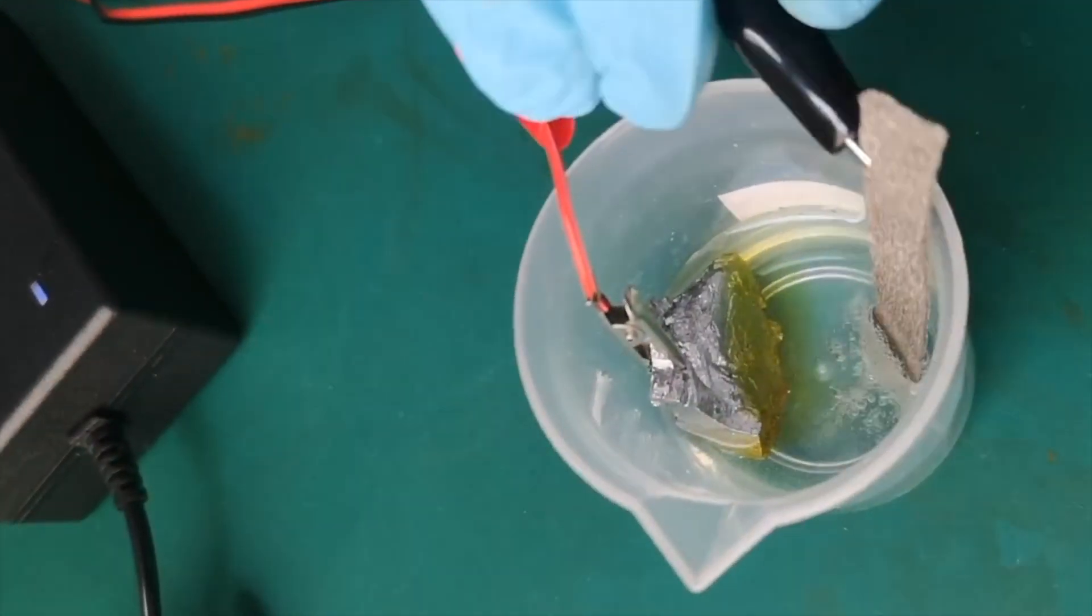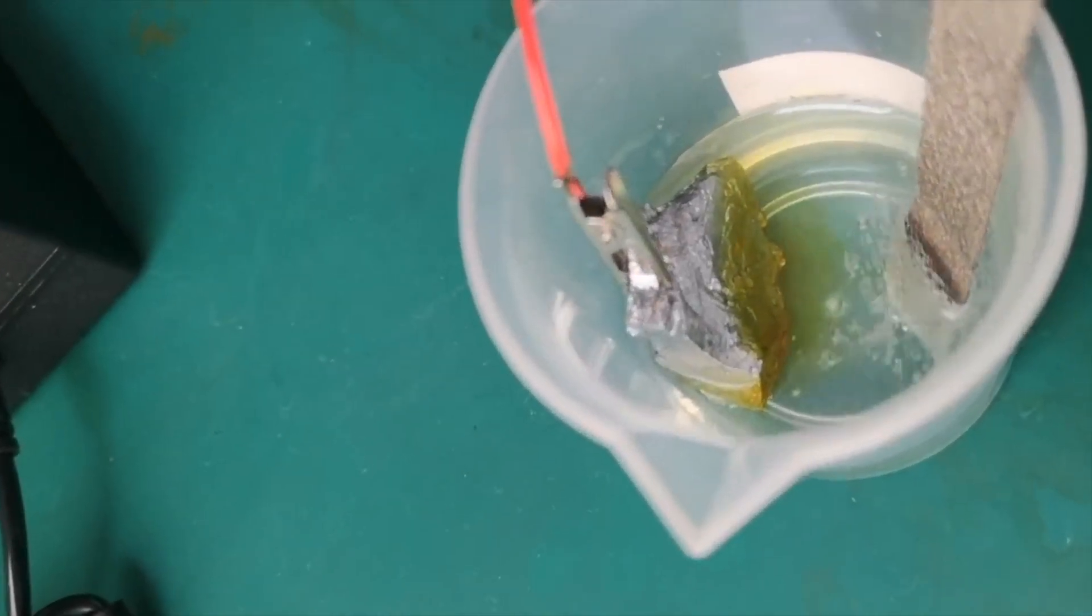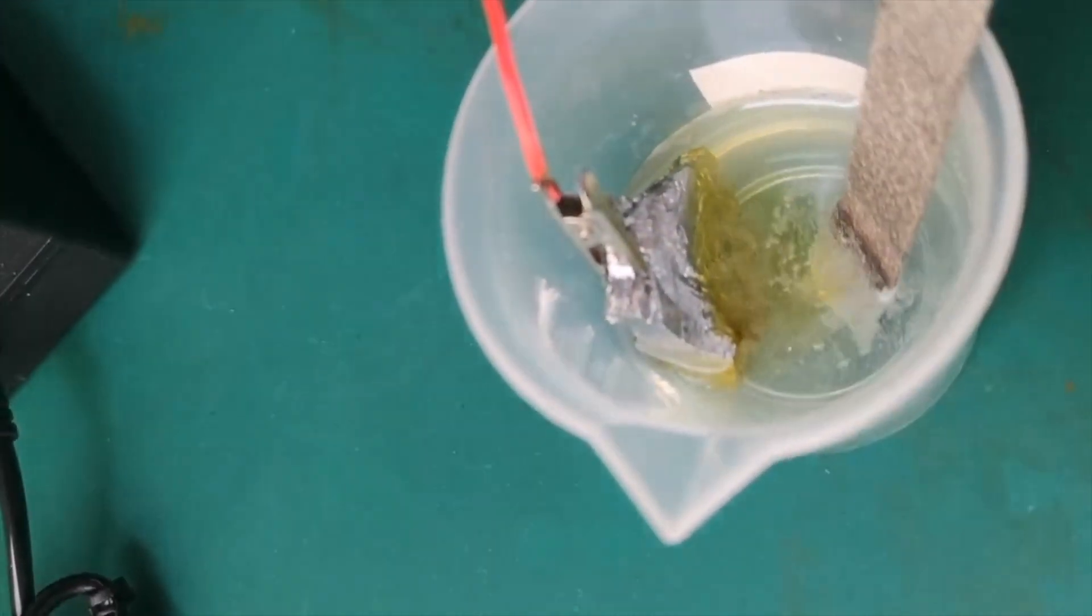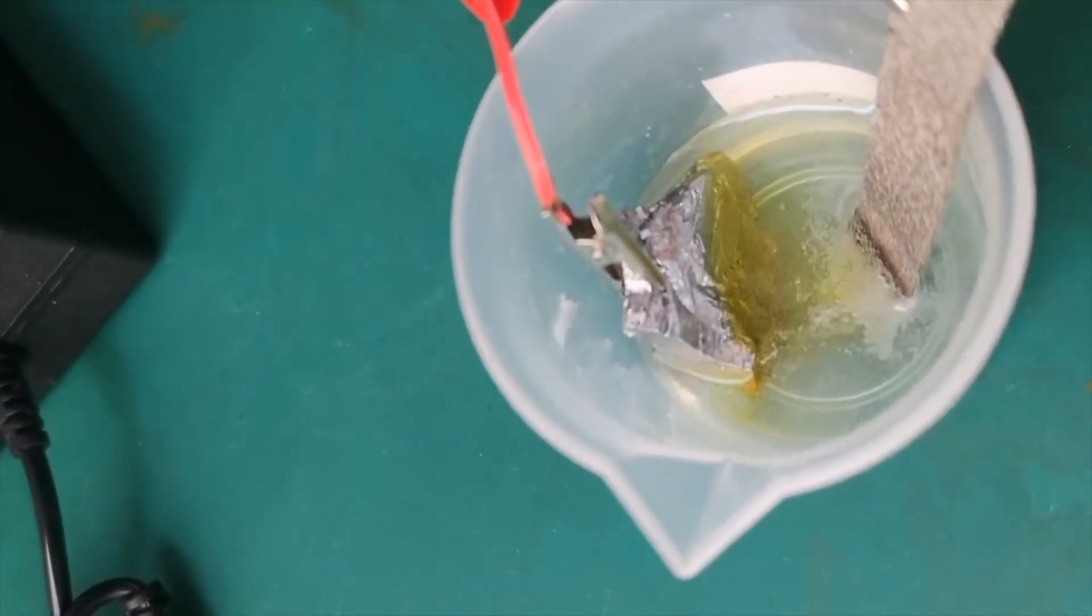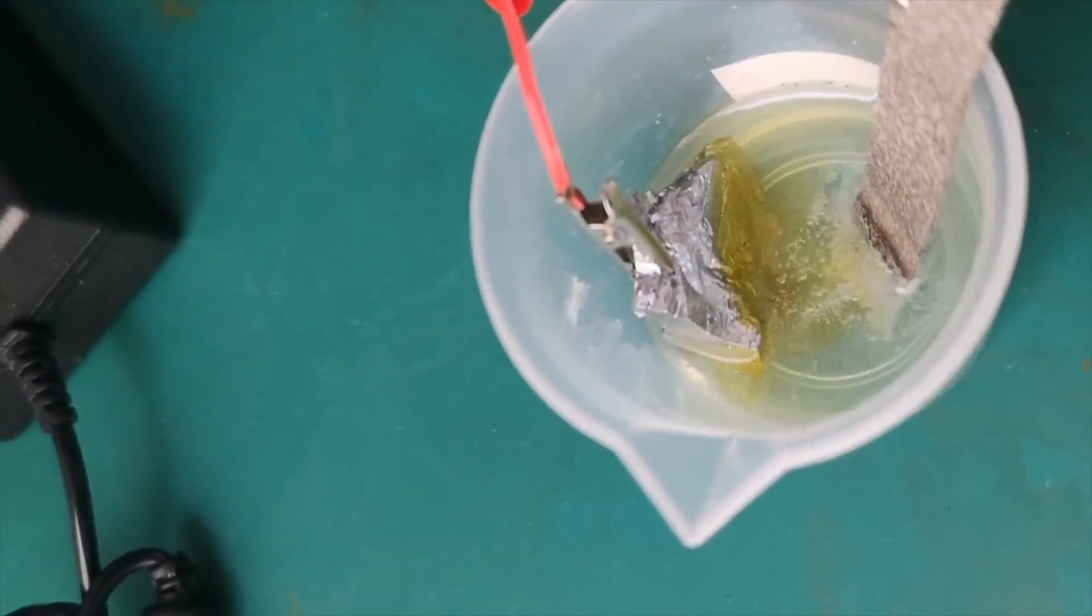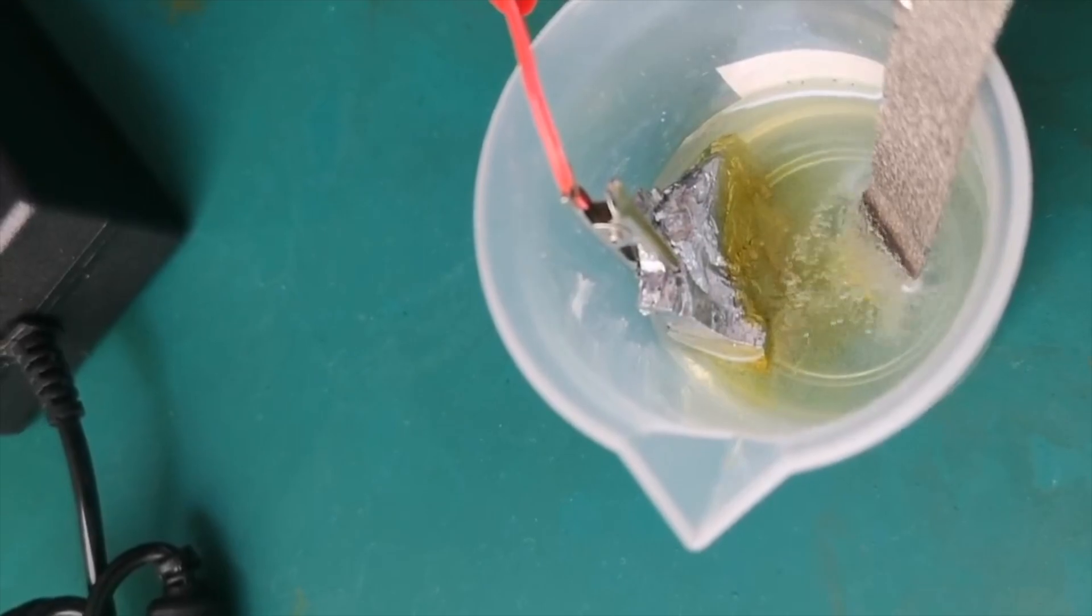As I switch on the power supply again, the cathode produces a lot of bubbles while the anode shows an orange-yellow color. The chromium is oxidized to chromic acid on the anode and dissolves into the solution.